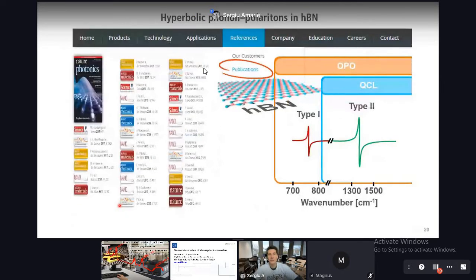Another popular topic, as proven by the large publication list, is the study of boron nitride and related hybrid 2D stacks. In all those studies, the fast IR images were performed at wave numbers covered by the QCL laser. In other words, somewhere between 1300 and 1500 wave numbers. The new OPO laser now opens the possibility to expand those studies below 800 wave numbers and access, for instance, the type 1 boron nitride band.